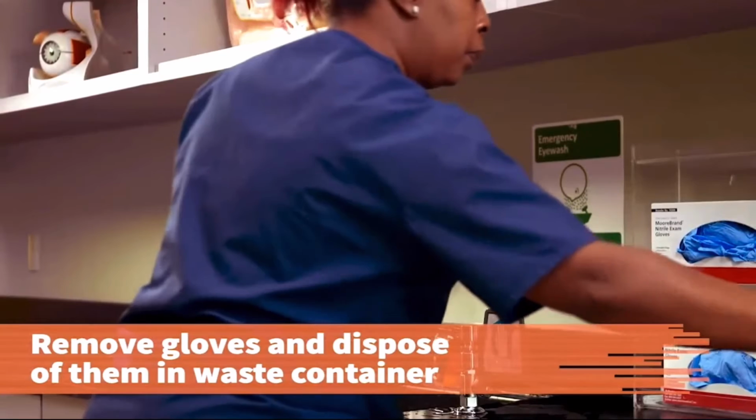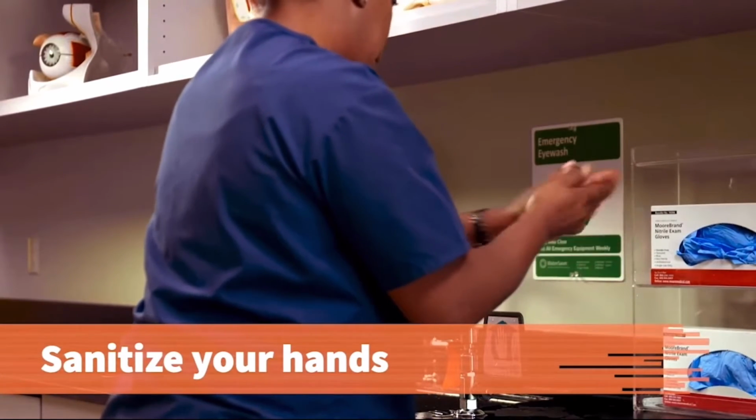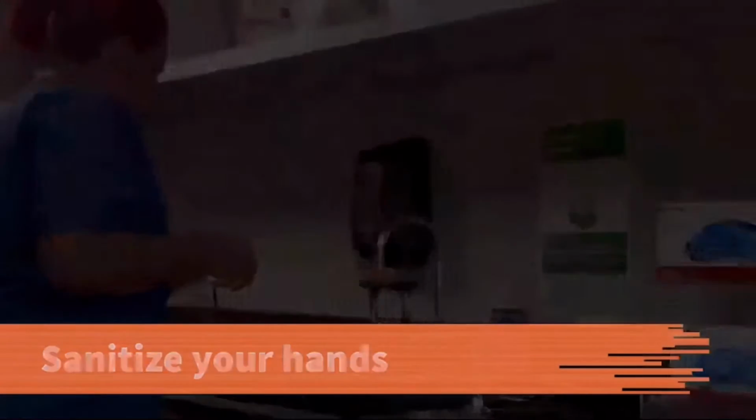Properly remove your gloves and dispose of them in a waste container. Then wash your hands or use hand sanitizer again.